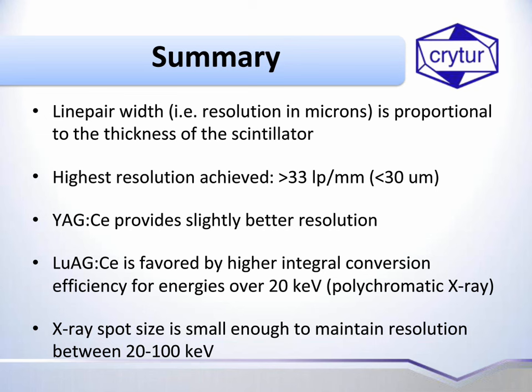Okay, thank you. Another question I have here is, is it possible to image an object larger than the scintillator, given that you can't focus X-rays? Well, it's a good question. The scintillator actually works as an imaging plate. So the object must be smaller than the scintillator itself, or it must be measured in parts. If the object is bigger than the scintillator, you need to do some small images and then put them together into a bigger image at the end. So the answer would be the object must be smaller, or you need to do some partial imaging.